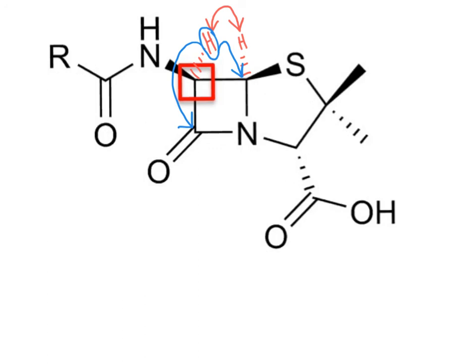So with that, we conclude looking at this example problem of specifying what correlations we would expect to see within a molecule. And a common way of representing that schematically is to draw the structure of the molecule and then use this arrow notation where single arrowheads indicate HMBC correlations between a proton and a particular carbon, and the double arrows indicate which protons have COSY correlations to which other protons, to provide us a schematic or a visual of how we piece together the structure of an organic molecule.